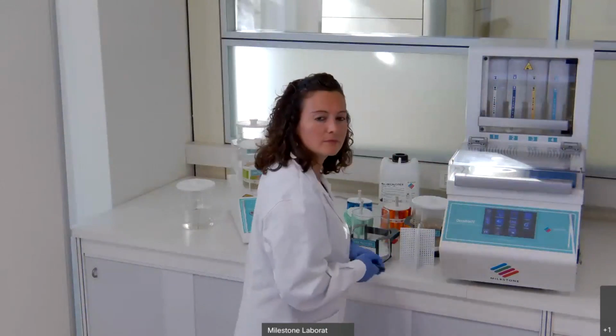Okay, another question with regard to the different reagents that I could use for decalcification. Is there maybe any publication about it? Yeah, we have a lot of publications regarding the decalcification topic, and in particular, there's one where they compare different decalcification reagents, from the chelating one up to the very strong one. They do the decalcification for the same time on different bone trephines, and then they analyze the quality and the quantity of DNA and RNA. And it's easy to see that the quality of DNA and RNA, if you use a chelating reagent, is higher than if you use the strong acid. Anyway, it's possible to find all publications on our website divided by topics.